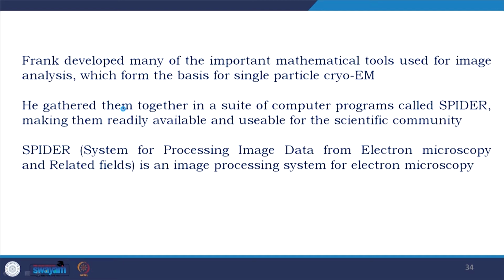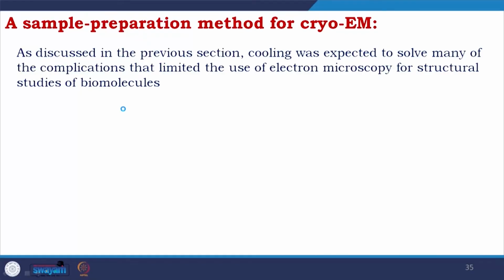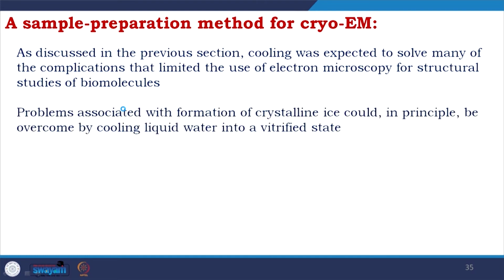So, we have already discussed the importance of sample preparation, how the sample preparation happened, what the procedures are and all. As we have also discussed in the previous section, the cooling was expected to solve many of the complications that limited the use of electron microscopy for structural studies of biomolecules, especially protein.